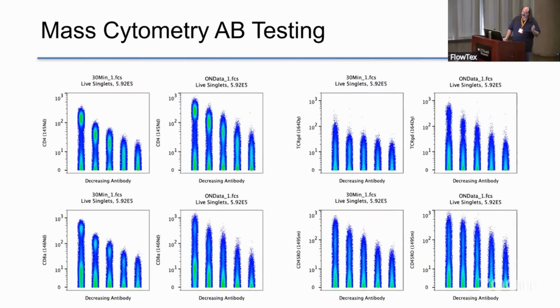And so here are all of the other ones. And as you can clearly see, oh, this one improved with overnight, that one improved with overnight, that one improved with signal, but once again, backgrounds got higher.